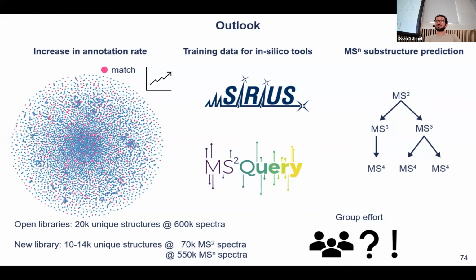And again, I think the development of tools is very much still in the beginning. There are so many tools coming out every year. I'm not able to test them all, but many of them look very interesting and promising. So I have high hopes that boosting public data in general, but also boosting annotated data, is going to be a huge increase. And we've seen that with language models and image recognition, that even unlabeled data is very useful and can be used by people, right?